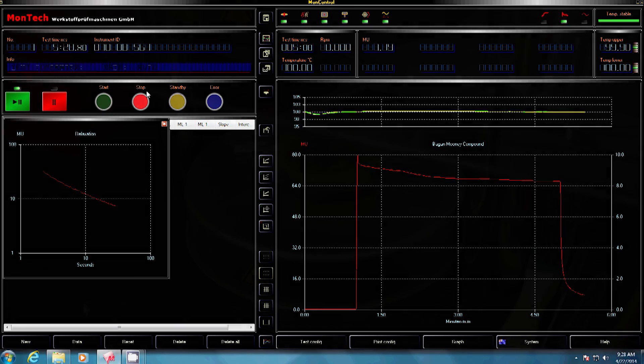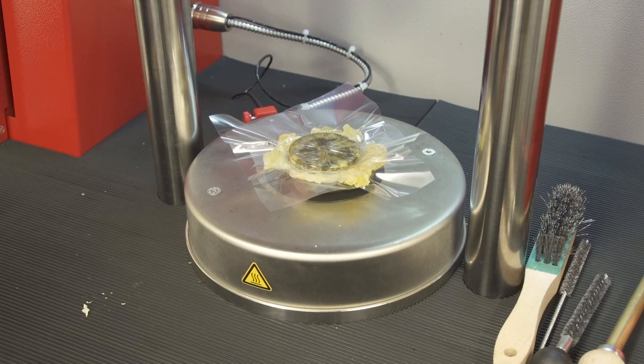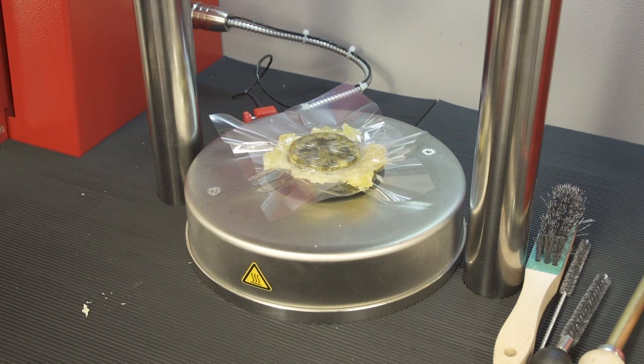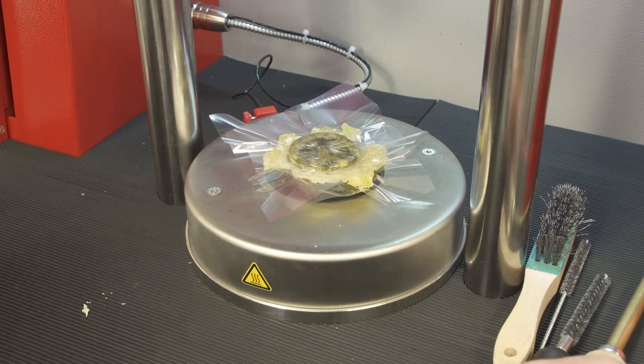Once the test is completed, safety shield and dies will automatically open. The rotor and tested material can be removed from the die.